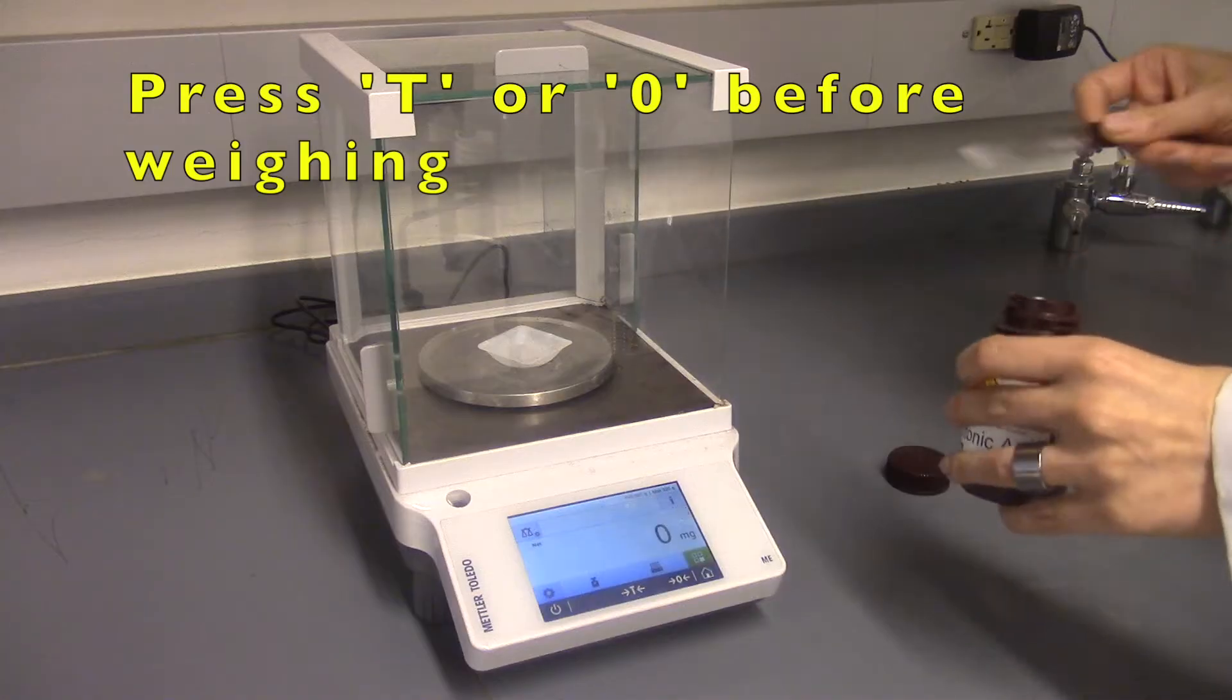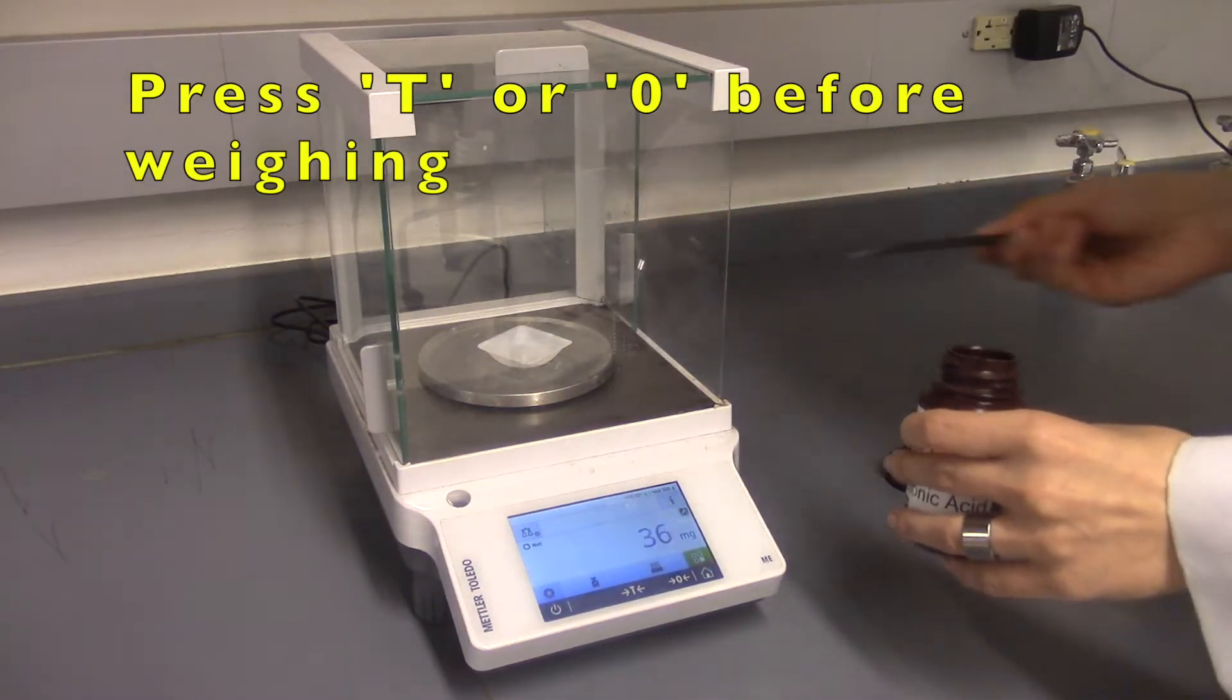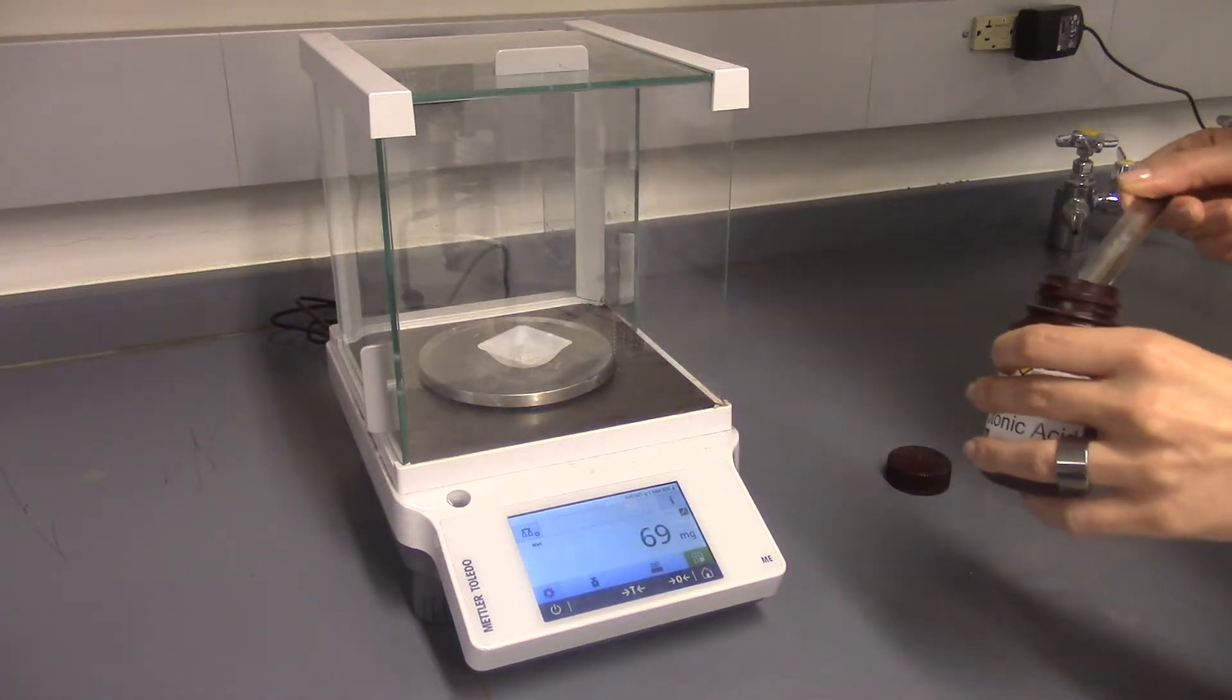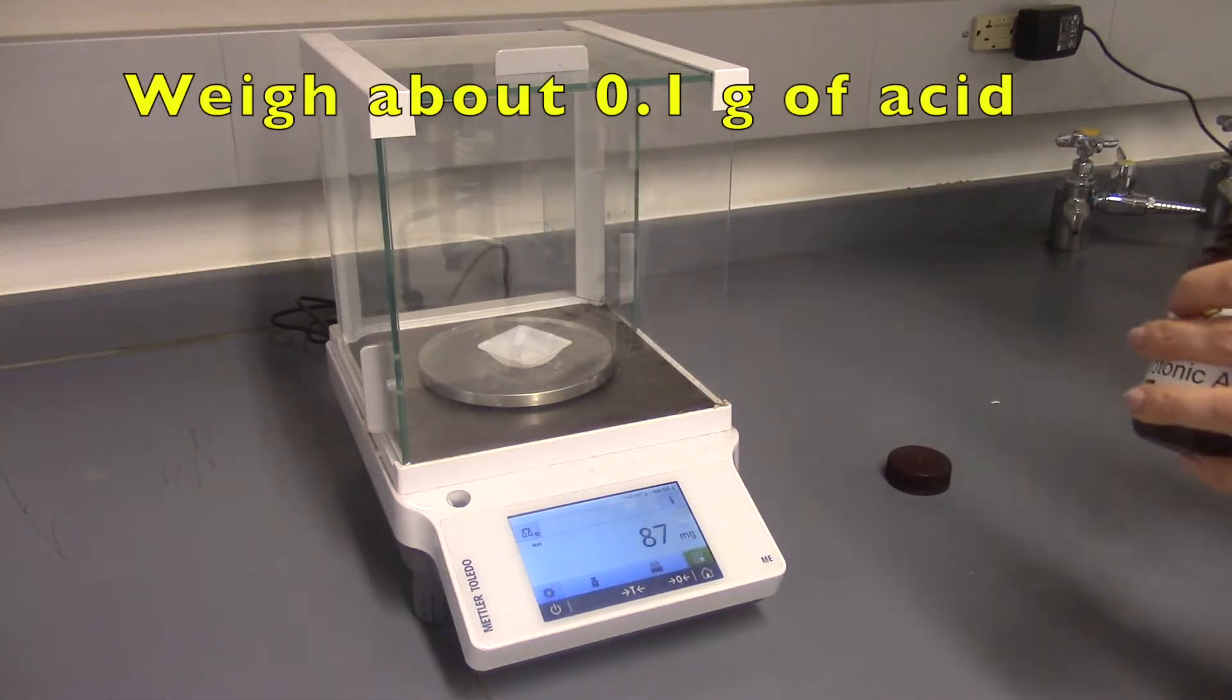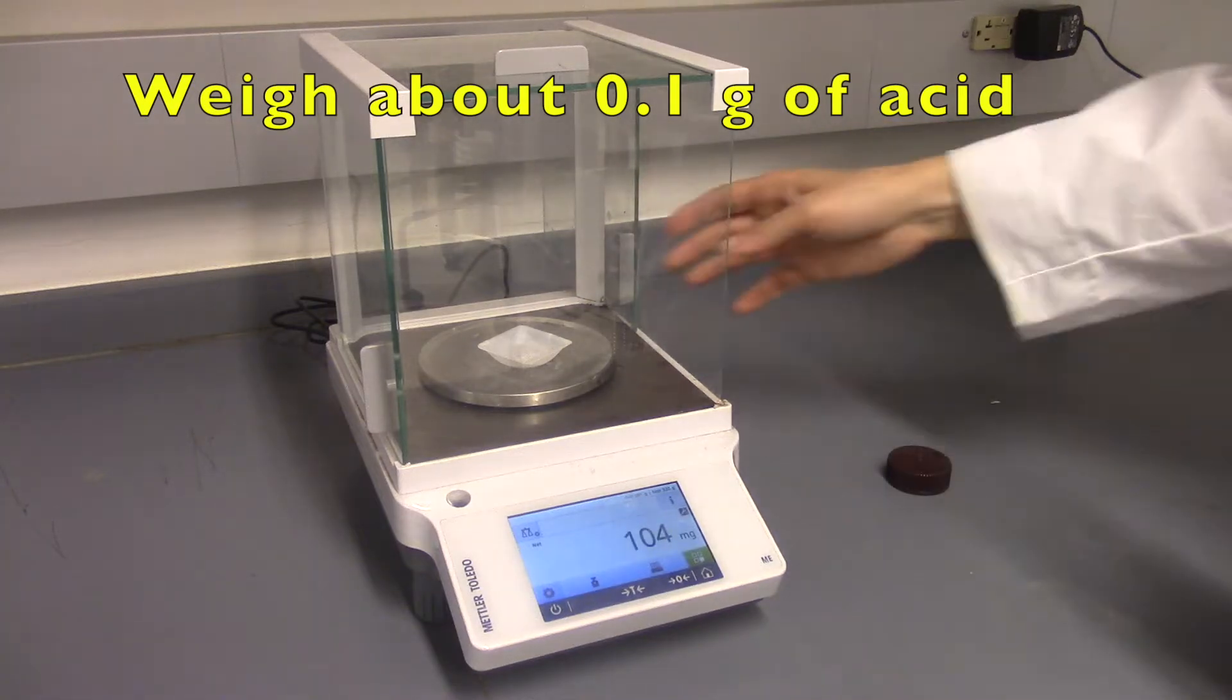Make sure to zero out the weigh board before you weigh any solid. Weigh about 100 mg of the acid. The exact amount is not important but you must record the mass accurately. Slide the door closed before recording the mass.